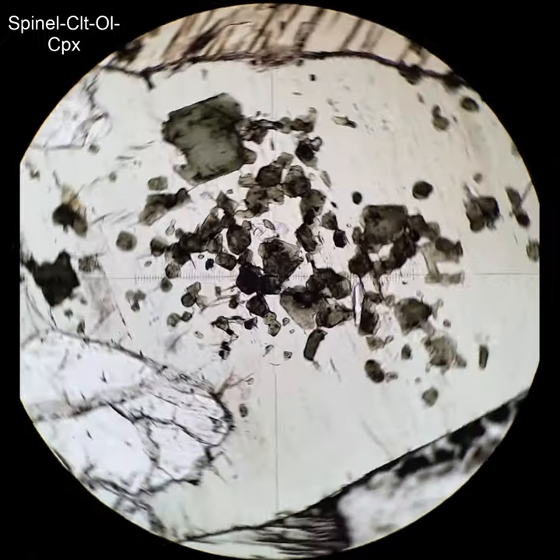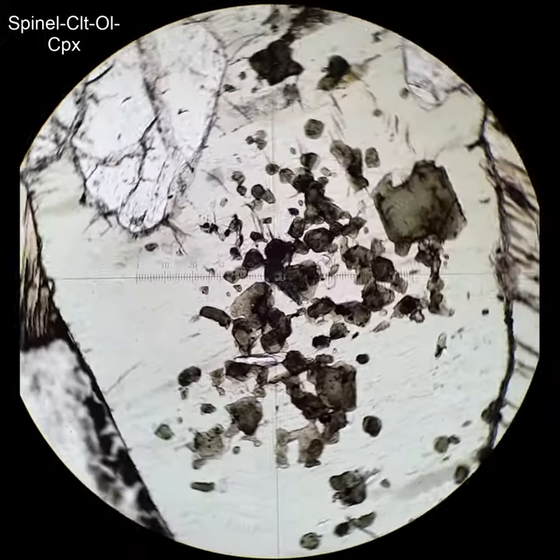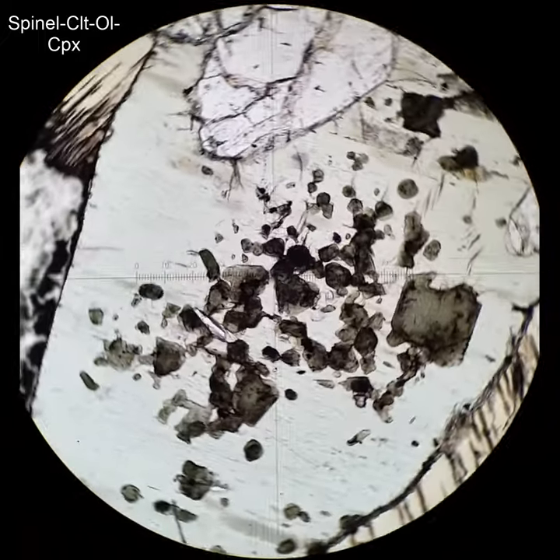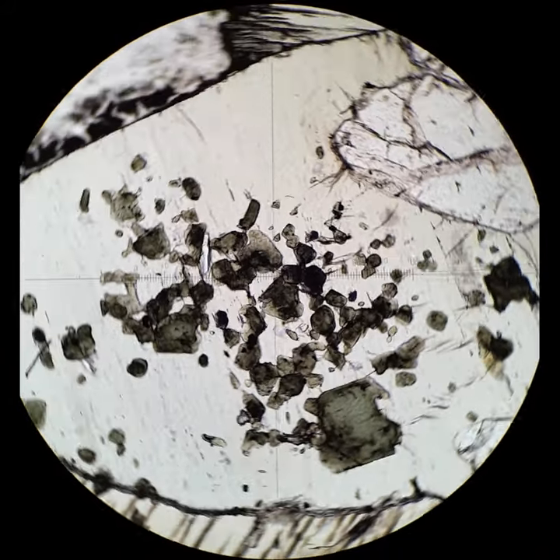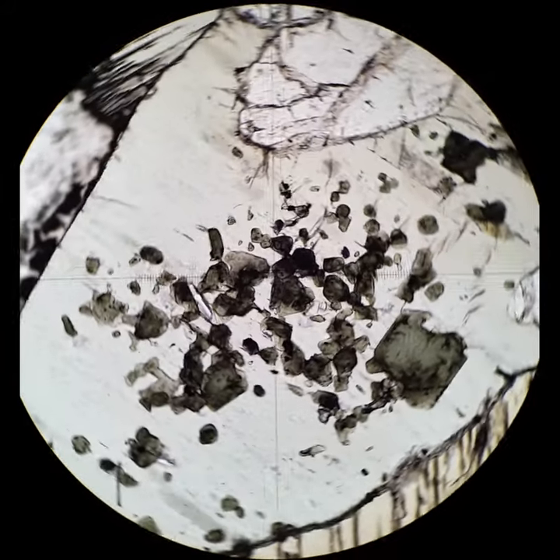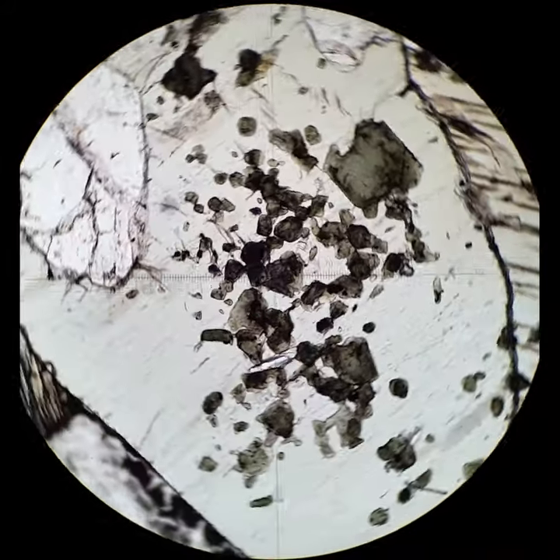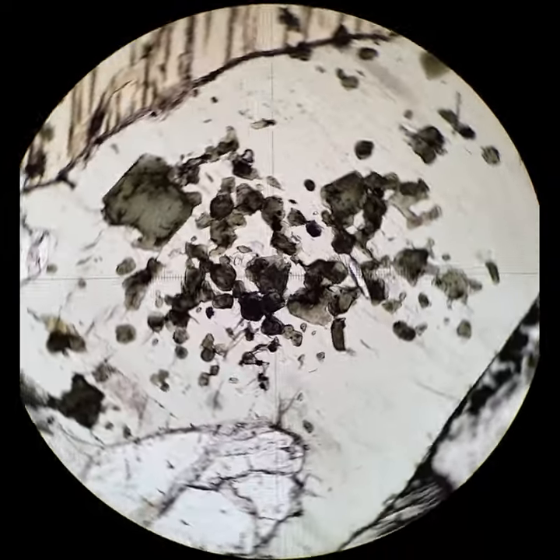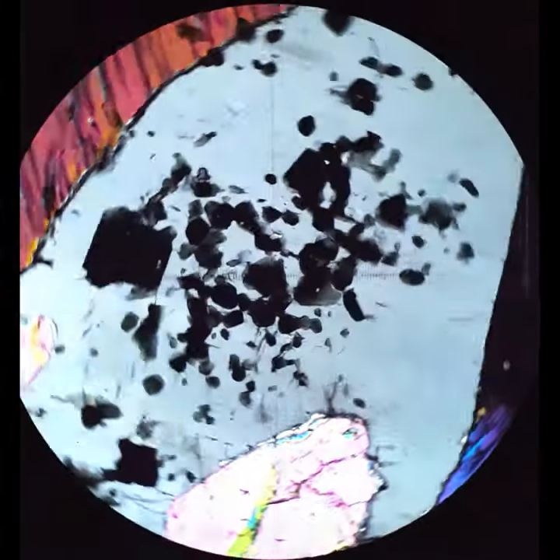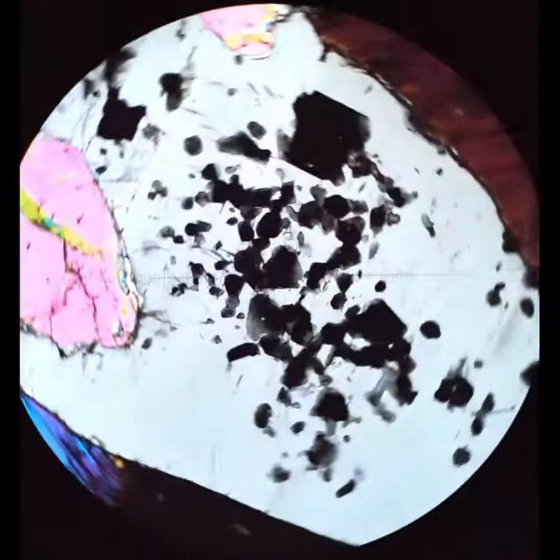Here's more of that green spinel from the calc silicate. The material around it is actually clintonite, which is an unusual calcium mica, but this is a nice example of a whole bunch of different crystals across the polars. They're all black and they just stay black.